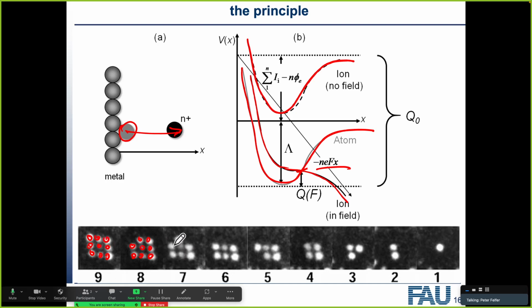So the brightness, unfortunately, is not everything. To an extent, it has something to do with which atoms they are, but mostly how much field they see. So the ones at the corner see more field, and they will come off first. The one in the middle will leave later, which is very important also for reconstruction. But whether this one is leaving first, or this one is leaving first, we can't really control. So this is the thermal part of the evaporation. And this is also something that we want to find out, if there is some systematic to it, or if it's completely thermally random.